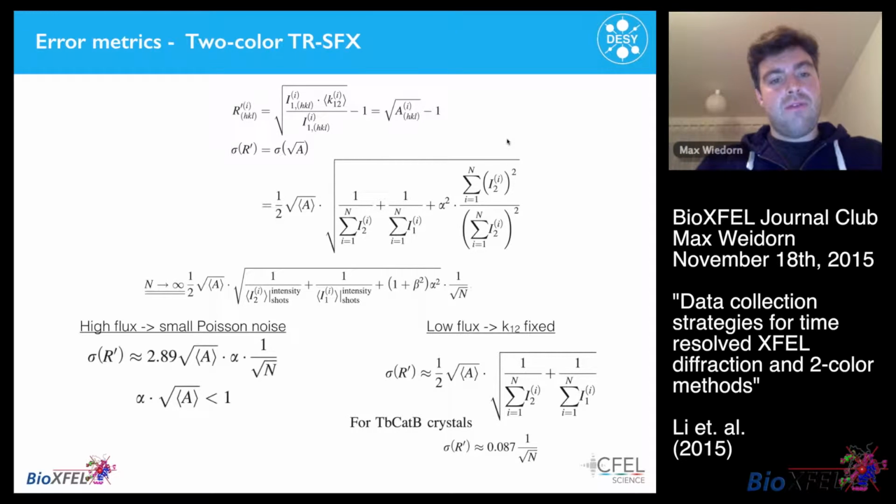One is the high flux mode, essentially what I've presented to you on the third slide, where you have full SASE pulses, two full SASE pulses, and you depend on the SASE effect twice. And since that is stochastic, K may vary a bit, or a lot.